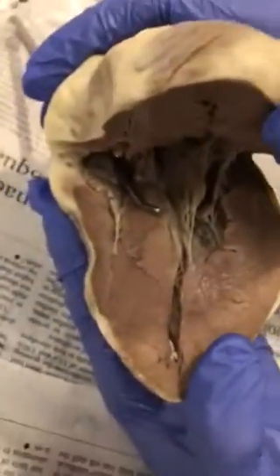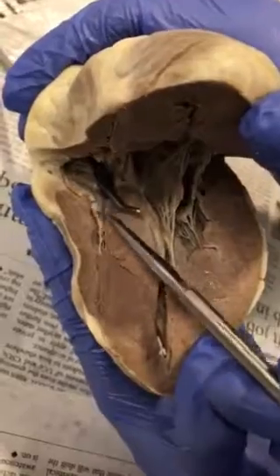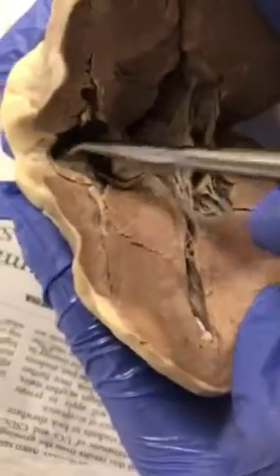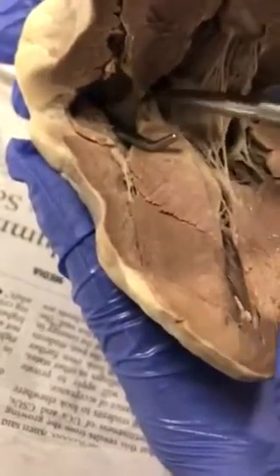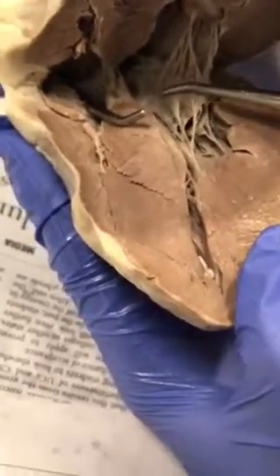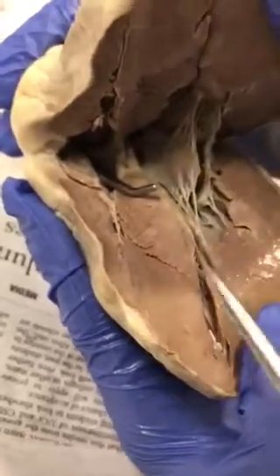We can see there's one here, and sort of one here. When we were cutting into the superior vena cava, we kind of cut the tricuspid valve, but you can see where it could have been. Here's where the other valve is, and that's kind of what the tricuspid valve would have looked like.